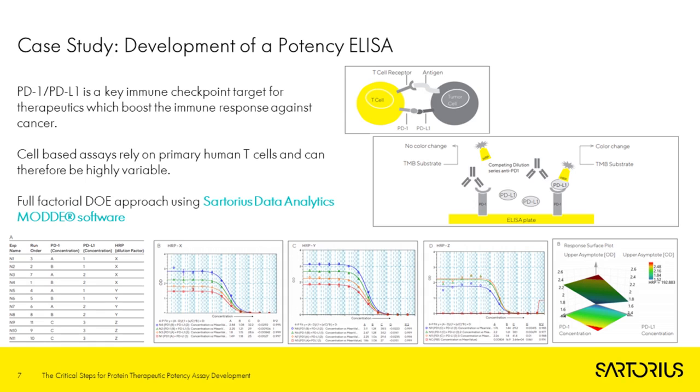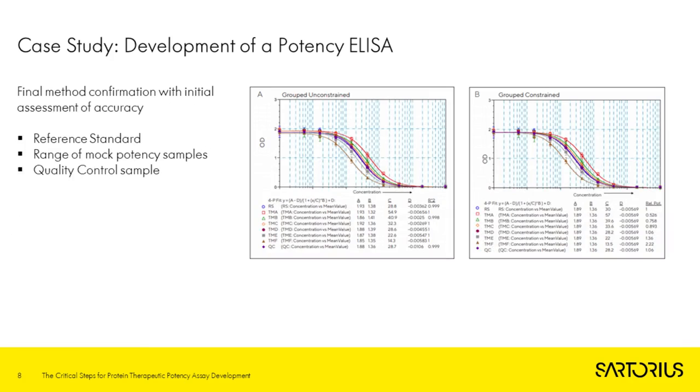And thinking about our key considerations earlier, you can see we're using a nice wide dilution series of our test sample at this stage to really try and capture the whole curve, and we've selected a robust endpoint on a GXP compliant system.